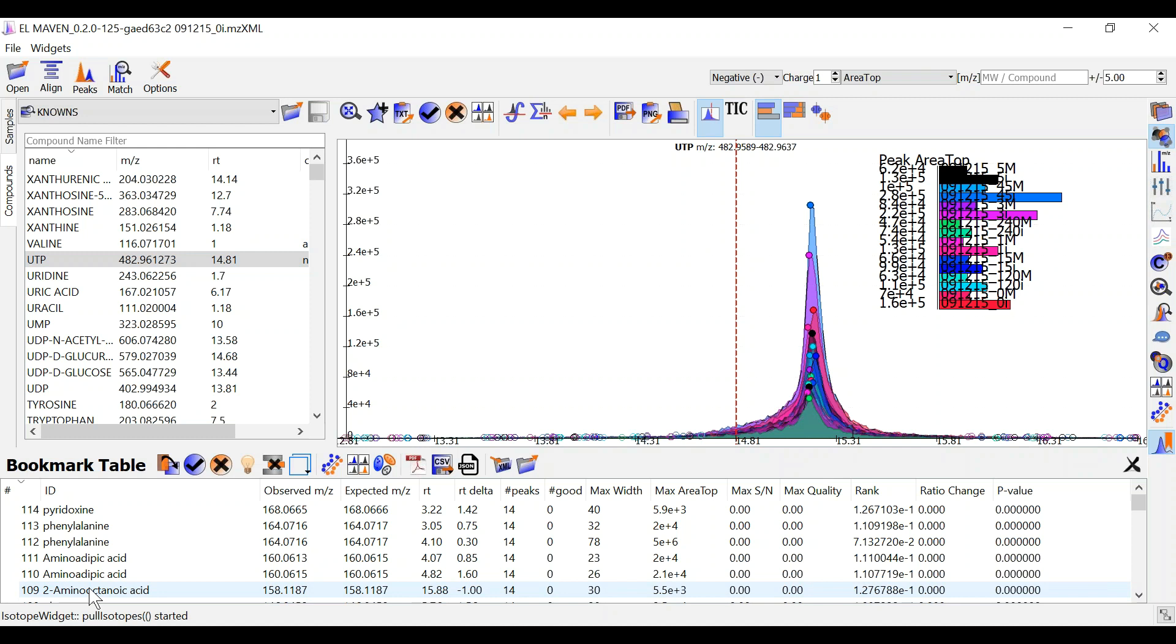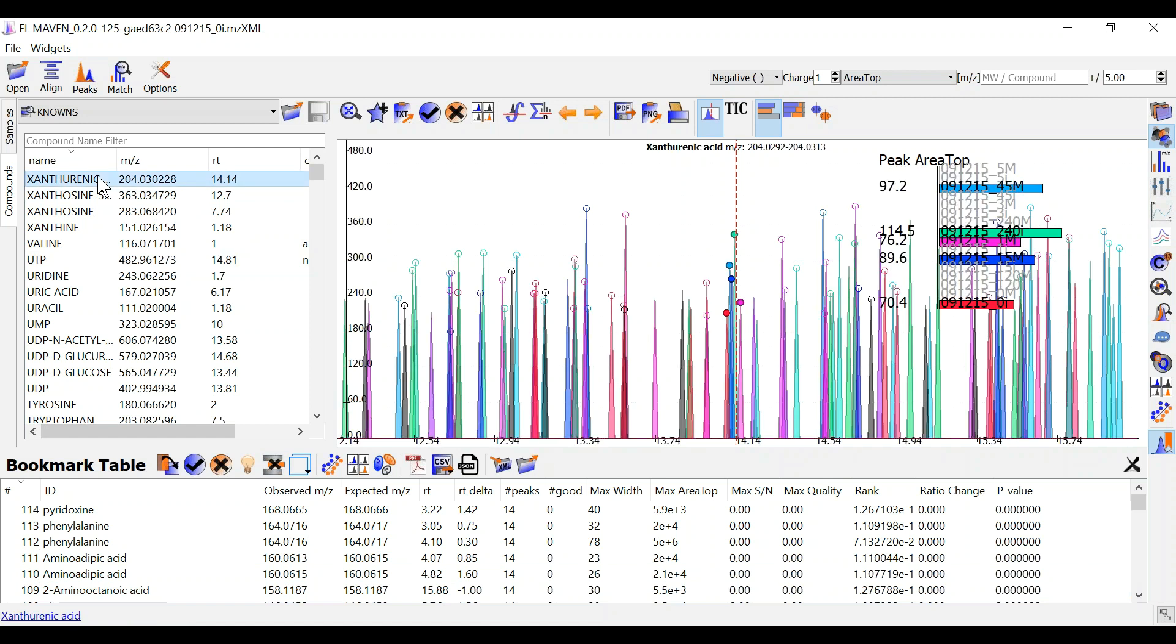The first is called manual curation. In this workflow you can browse on your peaks by going through each of the metabolites in this compound window.